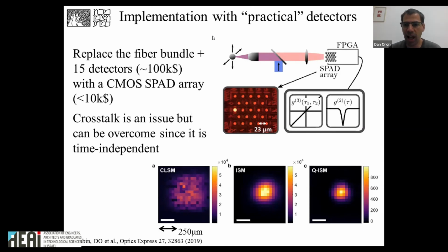So you need to establish a phase-sensitive spatial detection method. And in fact, this is something we're currently working on. There hasn't been a good realization of super resolution in coherent scattering to date, but I can tell you that we actually have a setup working in the lab. So I hope to be able to tell you something about this quite soon. So there's hope there, but the resolution enhancement is not amazing. It's a factor of 2 to 3, but it's still something.